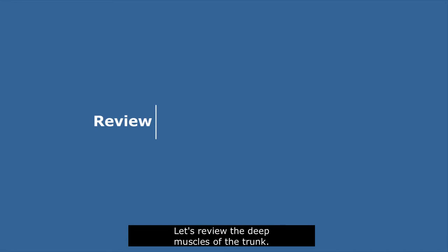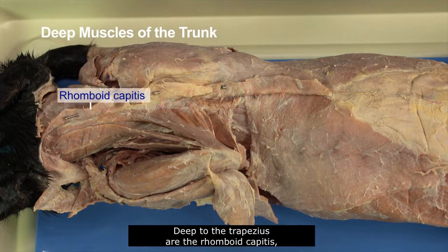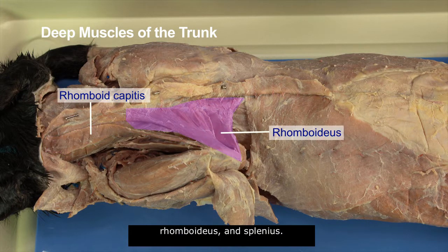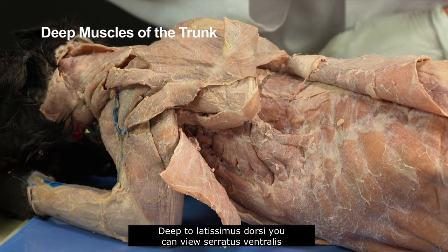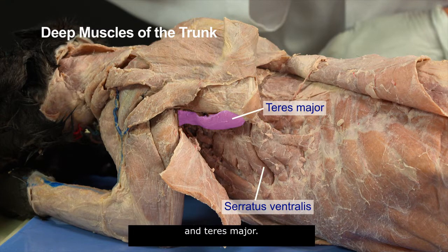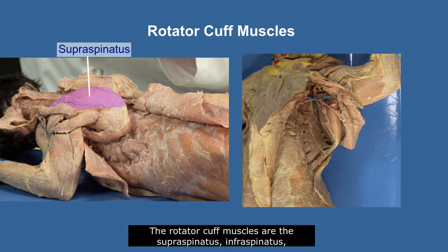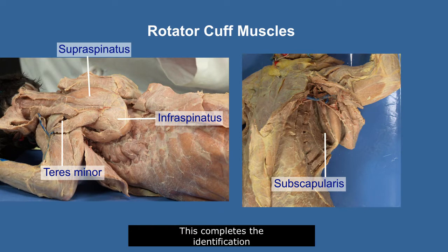Let's review the deep muscles of the trunk. Deep to the trapezius are the rhomboid capitis, rhomboideus, and splenius. Deep to latissimus dorsi, you can view serratus ventralis and teres major. The rotator cuff muscles are the supraspinatus, infraspinatus, teres minor, and subscapularis. This completes the identification of the deep muscles of the trunk on the dorsal side of the cat.